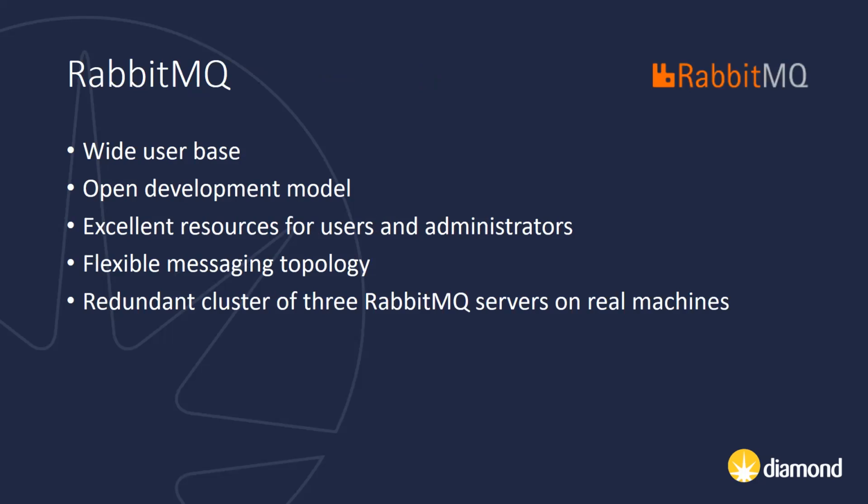Originally, when we implemented Zocalo, we started using ActiveMQ because that was used elsewhere at Diamond. But over time, as we started to use Zocalo more and more, and rely on it more with the unattended data collection, we started to see problems with that. So we've recently completed a project to switch to using RabbitMQ as the underlying message broker.